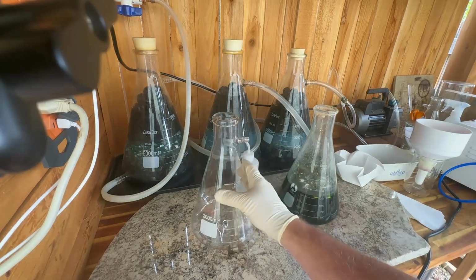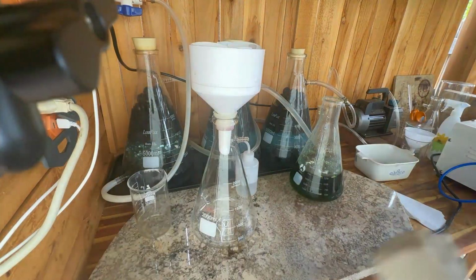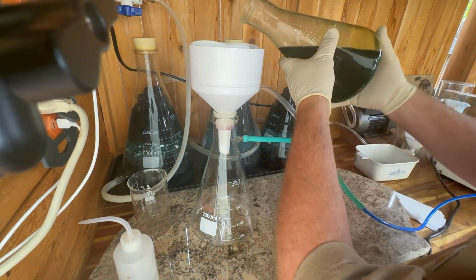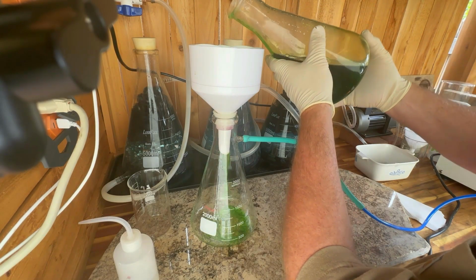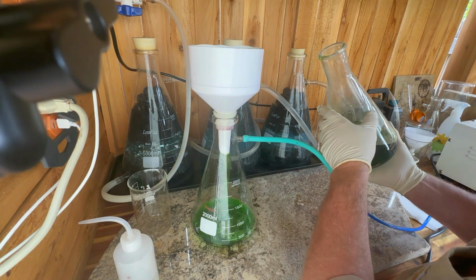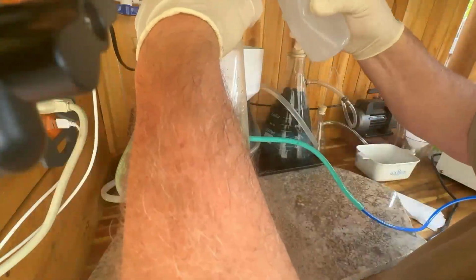Okay, well, this is filtering, and we'll talk a little bit more about what the solution is and where it came from. As I mentioned earlier, initially this started with a gold-filled refine, and this beaker contained the washes, both from the dirty drop, the initial drop, as well as the refine washes for that refine. And as normal, like my other temporary stock pot, it was pretty normal, other than somewhat dirty because of the initial dirty drop wash in there. Interesting with this one was that the gold powder that had settled on the bottom of the dirty wash solution just dissolved one day. Not exactly sure how or why, but it went into solution.